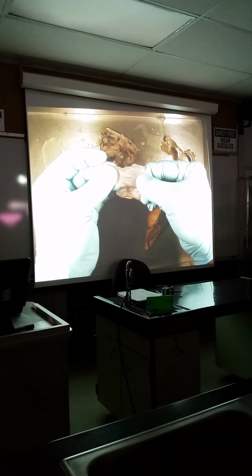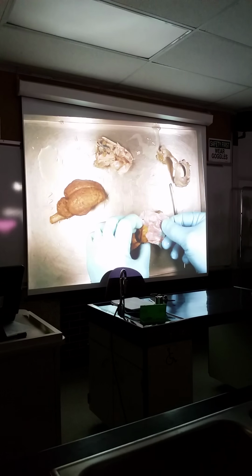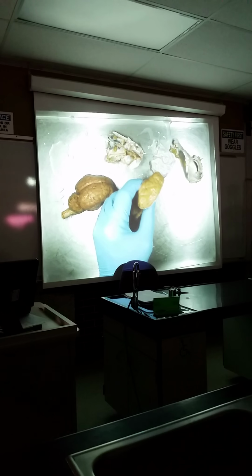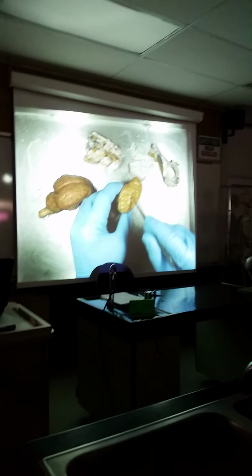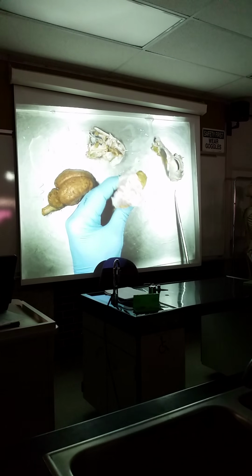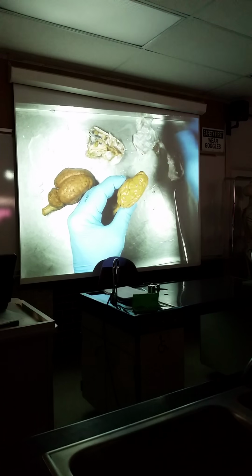This is dura mater, and I want you to feel how tough it is. Very tough stuff. It used to be on top here. The pia mater is what makes this brain look glossy. You could peel it away. I don't really want you to, but it actually is what makes this brain look glossy. You can see it right on there. This used to be like that. Dura mater on top. Someone peeled it off.